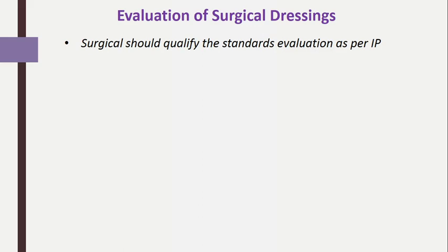It is essential to check the quality of the surgical, whether it is in our specification or not. All this evaluation is done as per the Indian Pharmacopoeia 1996.